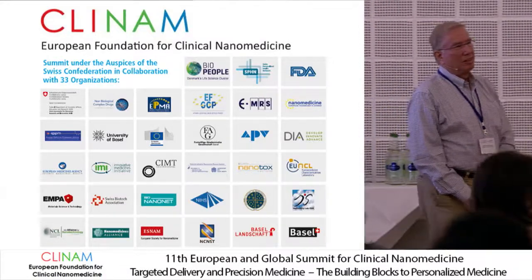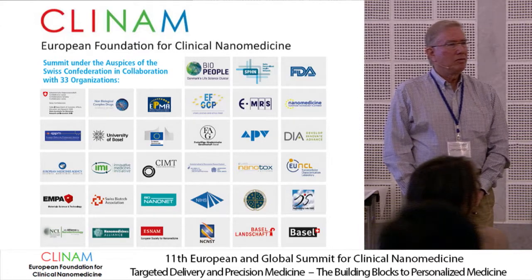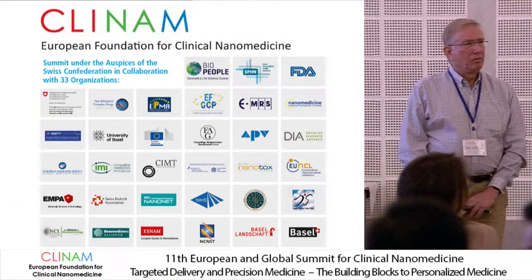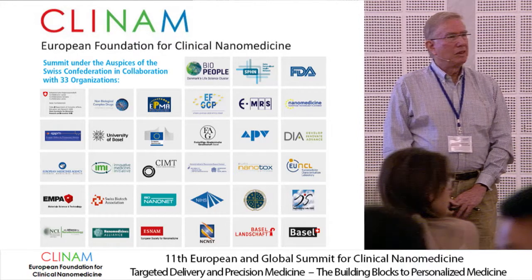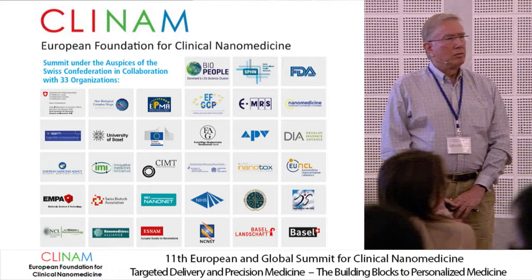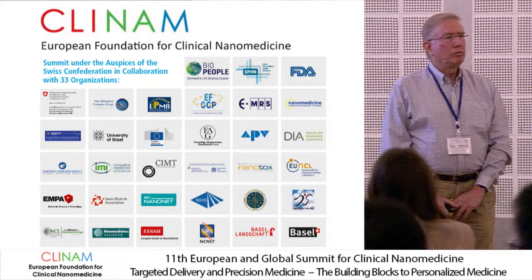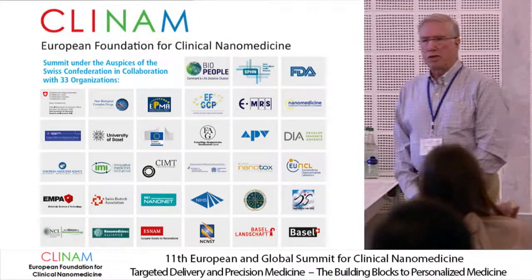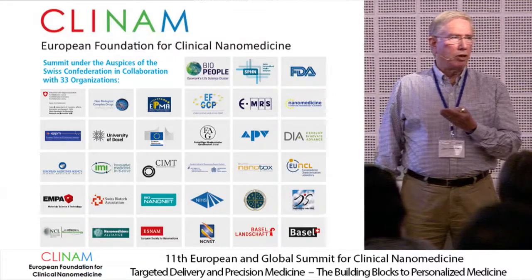I have one question. From a biological view, I saw in your images that after the vesicles wobbling, you have a lot of holes on the cells, which you do not expect, because then you can expect that the water will go into the cell and they just explode. So can you comment on that? These are not holes. What you saw were not holes. We looked at a fracture.